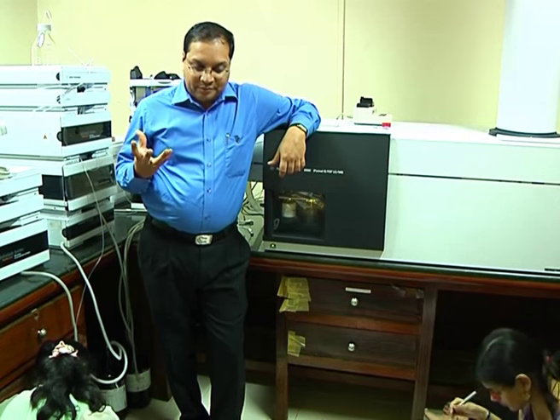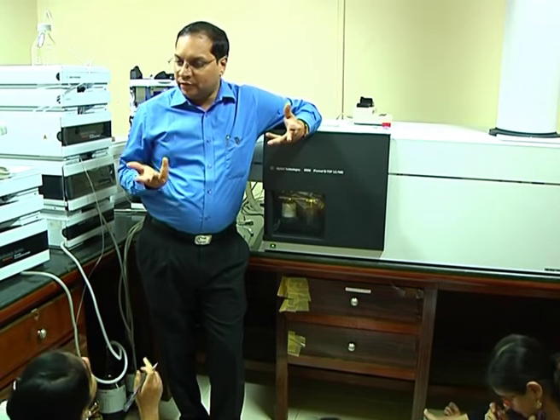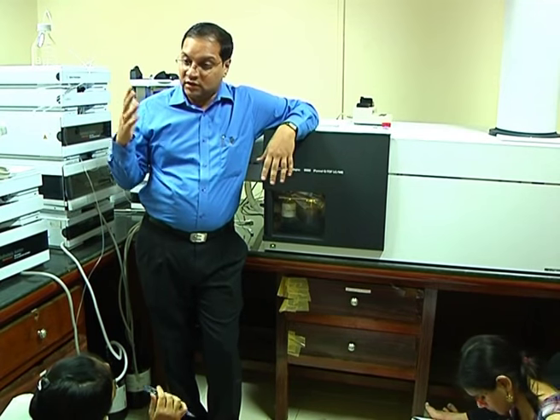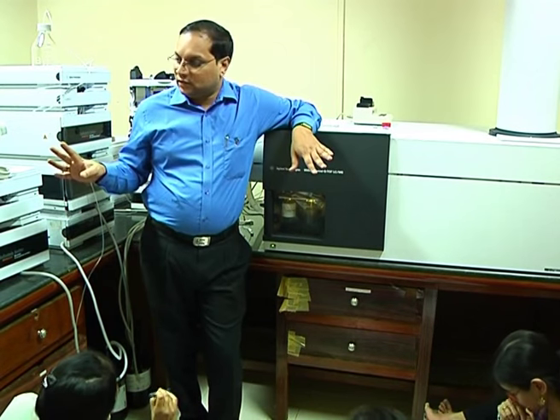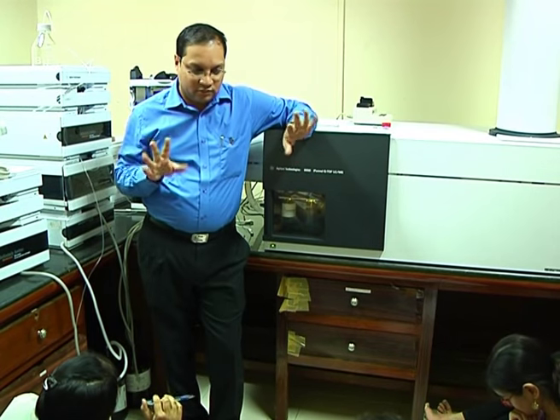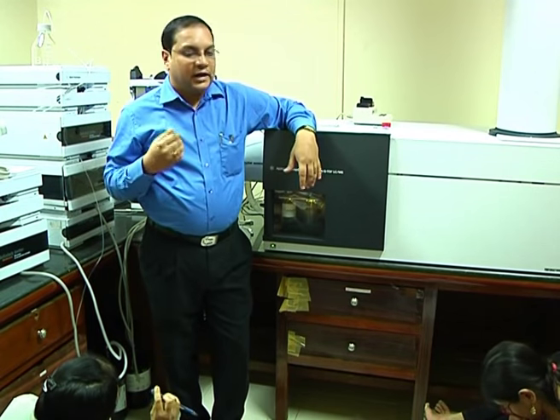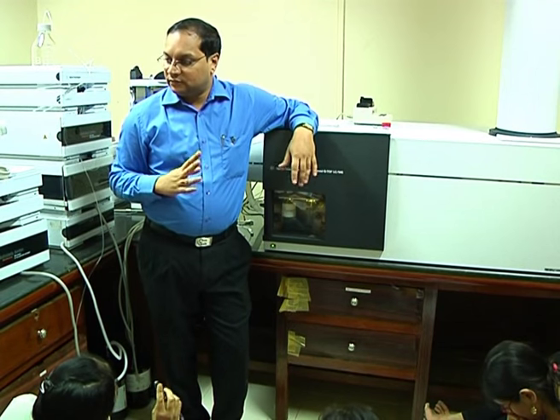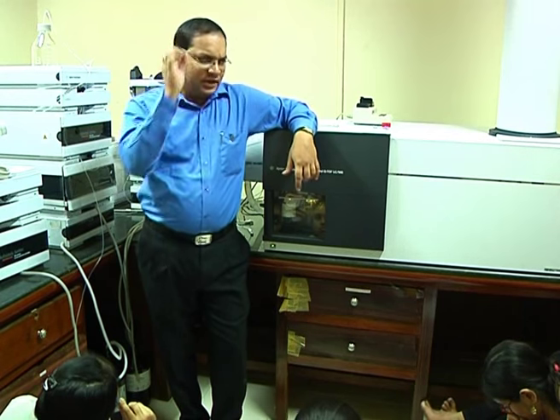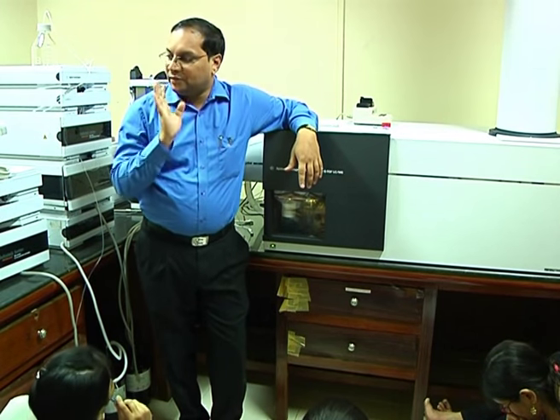I have some sample which is complex. I don't know how many peptides, which peptide is coming at what time, at what concentrations. I have no clue. I cannot guide my quadrupole to select what and when. So let the instrument decide. Depending upon the data as it comes, in real time, decide to fragment.